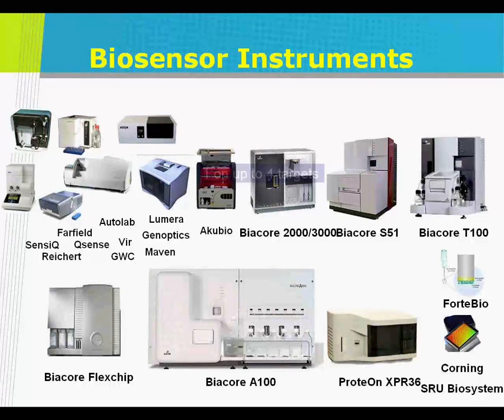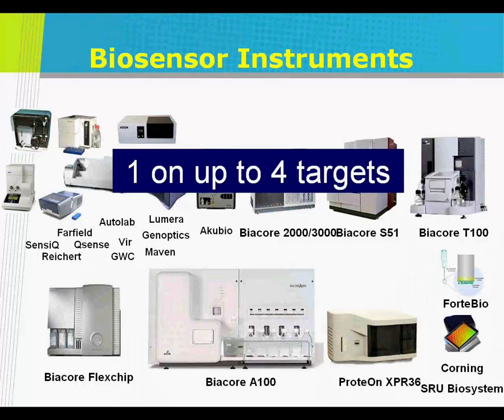As I said, Laura has asked me to talk a little bit about the underlying SPR technology, and explain in context how it works in a ProteOn. So let's see if I can do a reasonable job.